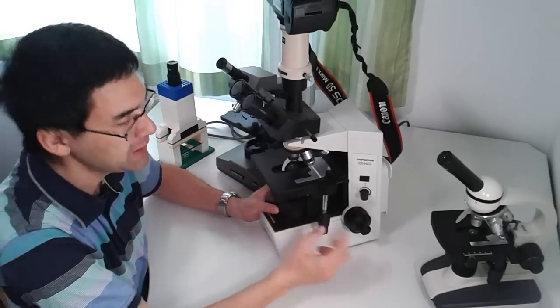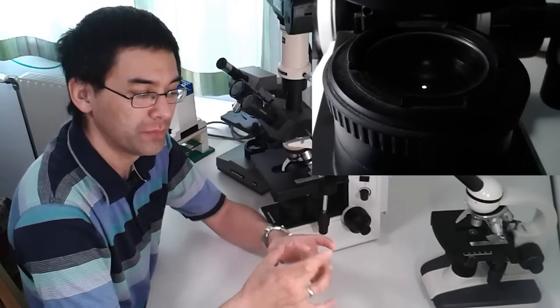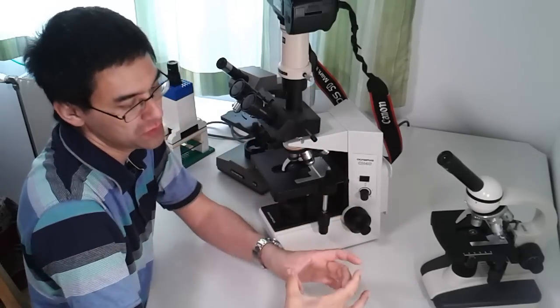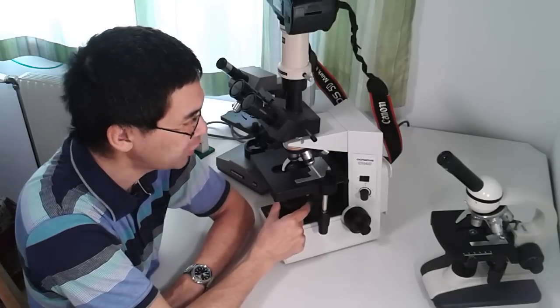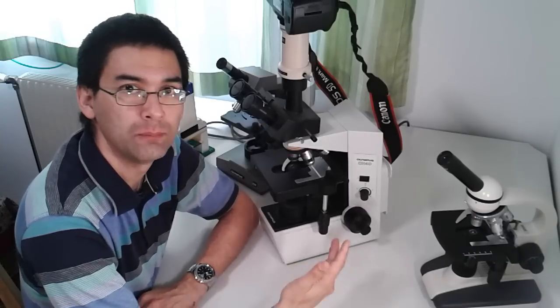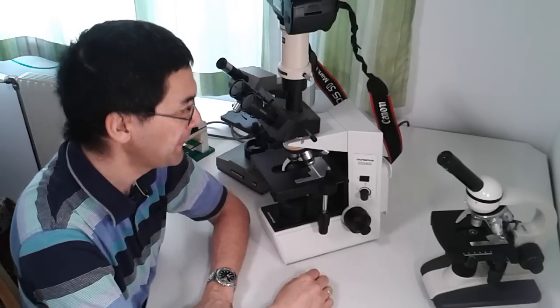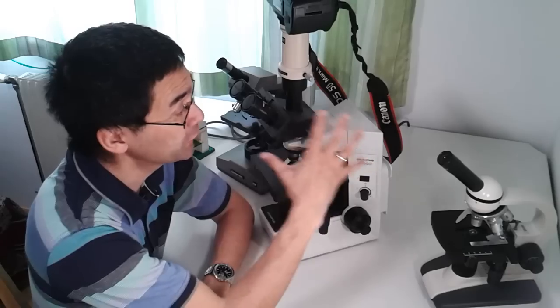The second reason I bought the CH40 is its field diaphragm. Above the lamp there's a second diaphragm that controls the diameter of the light on the slide. This reduces stray light and improves image contrast in photography because you limit light to only the visible area. The third reason is its 30-watt halogen lamp — very bright — which provided sufficient light for photography at a time when LEDs weren't available on microscopes.